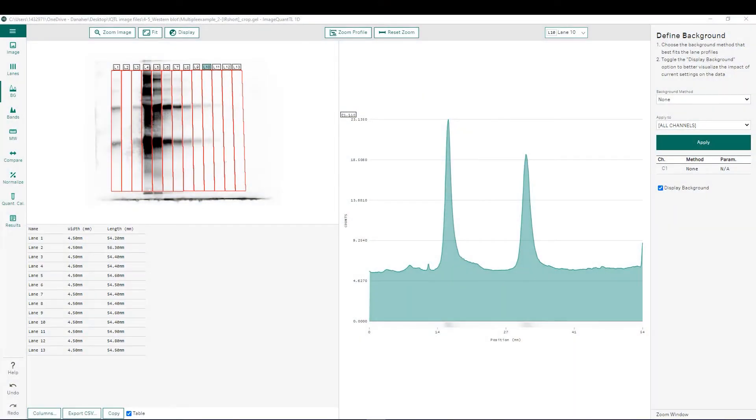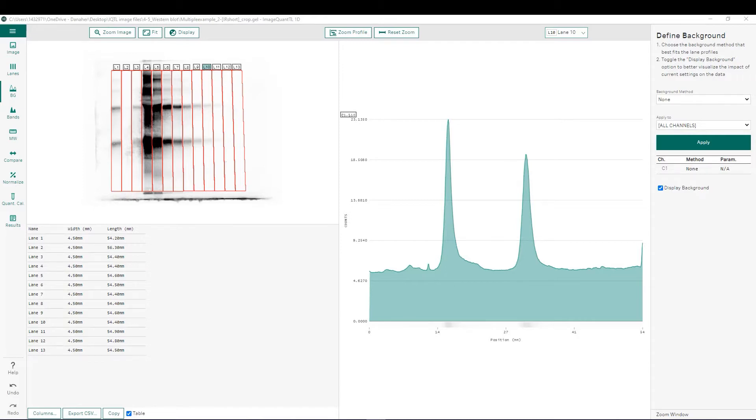In this Image Quantile version 10 tutorial video, we will be looking at background subtraction for gels and western blots. Specifically, we will be comparing and contrasting the different background subtraction options, as well as showing how background subtraction can affect the quantitation of the image.